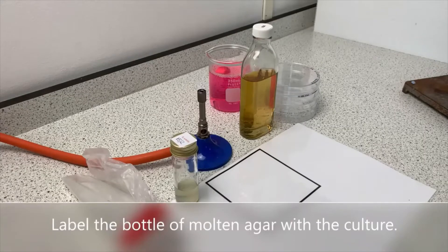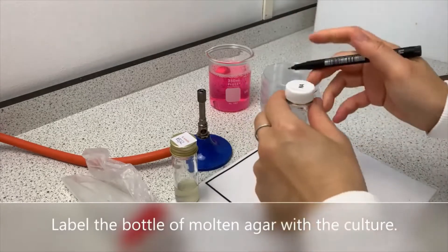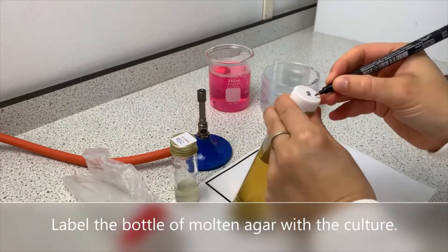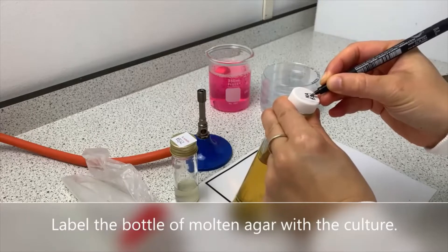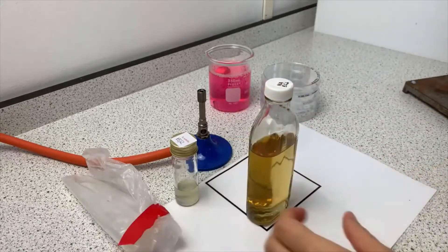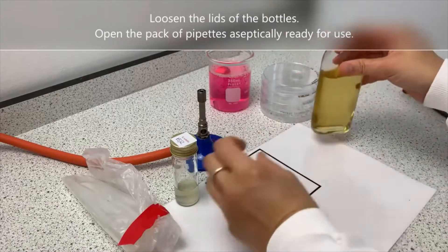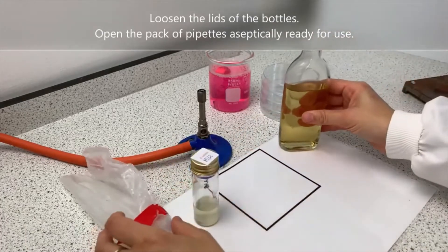Label the bottle of molten agar with the culture. Loosen the lids of the bottles and open the pack of pipettes aseptically, ready for use.